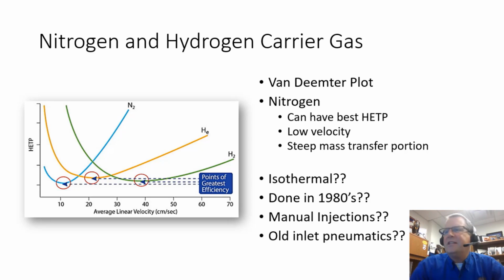One thing I know that CEM and Lucidi are talking a lot about these days are carrier gases. I've become a fan of nitrogen, and I think a lot of folks are wanting to work with hydrogen. And we remember, of course, this is the plot that everybody posts and shows you online about why you should do this. And you see helium's kind of in the middle here. Nitrogen, everybody says don't use nitrogen. Everybody says you must use hydrogen. That's a question that I'm actually working on. I'm very interested in this question.